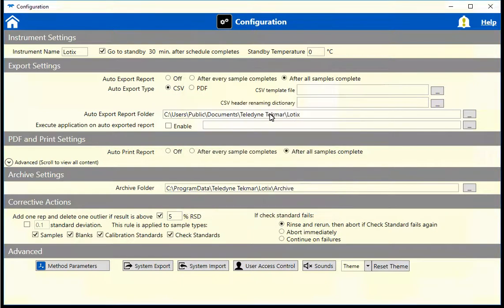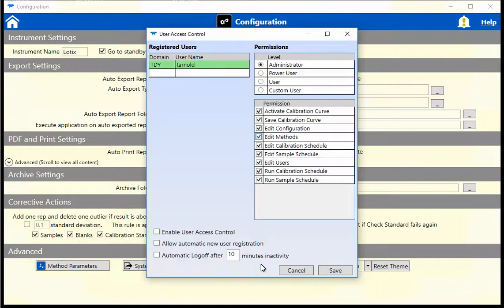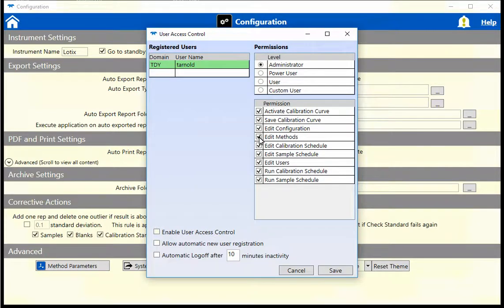If there is a need to have control over each user's access in the software, that can be done in the User Access Control. Check boxes under the Permissions column can easily be checked or unchecked to preference.